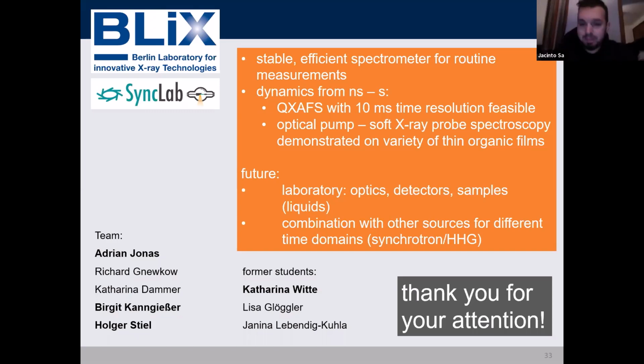Hi, Nina. One thing I would like to ask you, do you think it's possible to do the other way around, like X-ray pump and optical probe? For example, if you think of the titanium where you would pump the valence electrons with the X-rays and then look at the dynamics with the optical, because that has this clear relaxation on the optical because you can no longer excite the valence electrons in the same way.